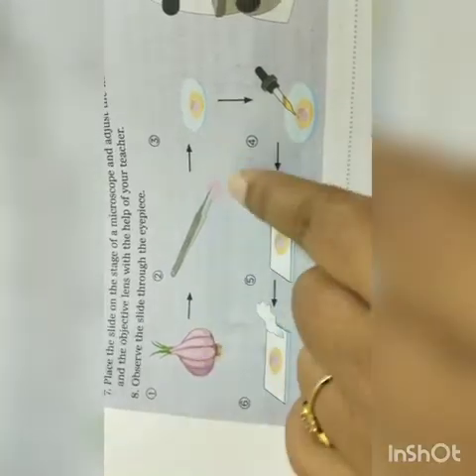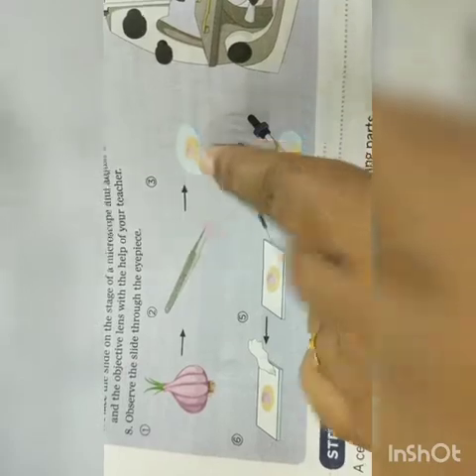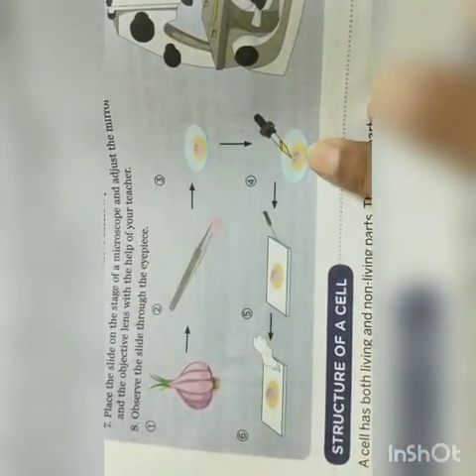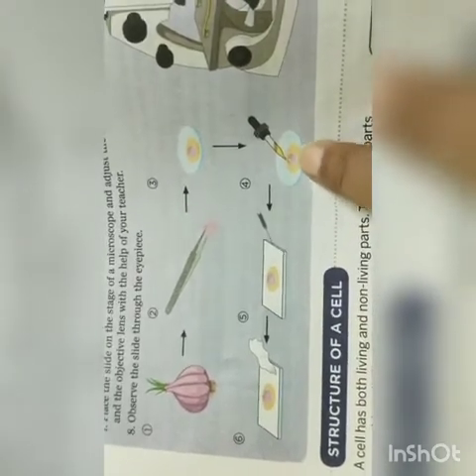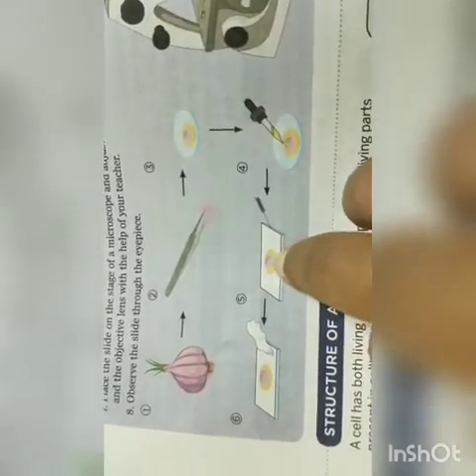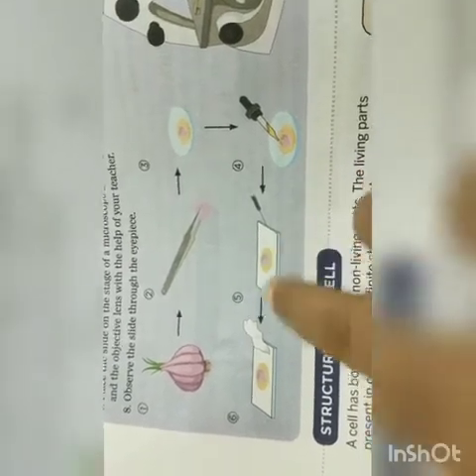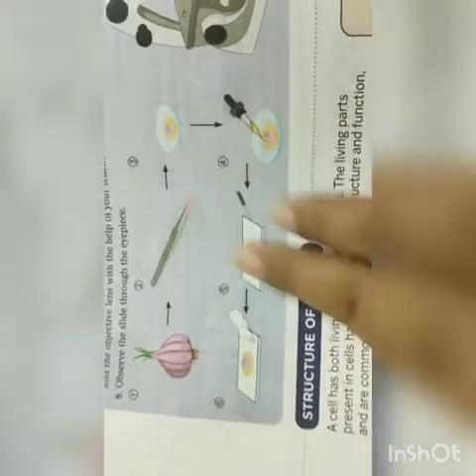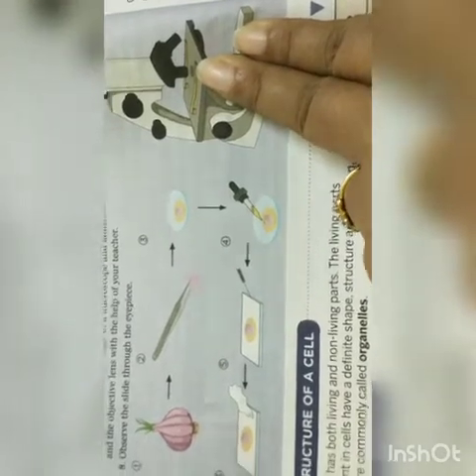It is taken out with forceps, then placed in a petri dish, which is a small plate. Then they drop some stain here. After that they place it on the slide. Then they cover it with a cover slip. Like that they do it. After that they observe it under the microscope.